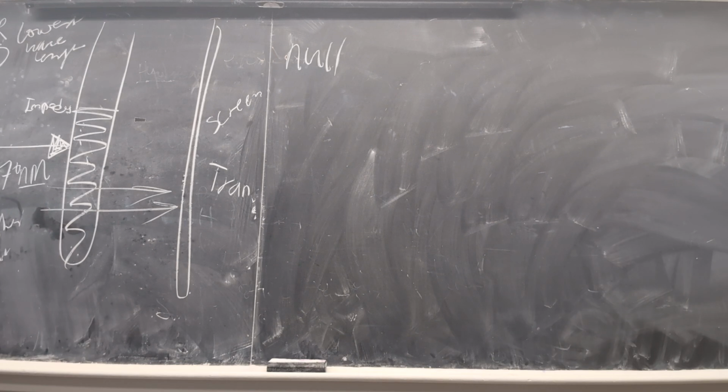Does everyone need to wear gloves? Yeah, that's how it is. Professor, does everyone need gloves? If you're going to be touching the stuff, because we don't want to cross-contaminate our samples.